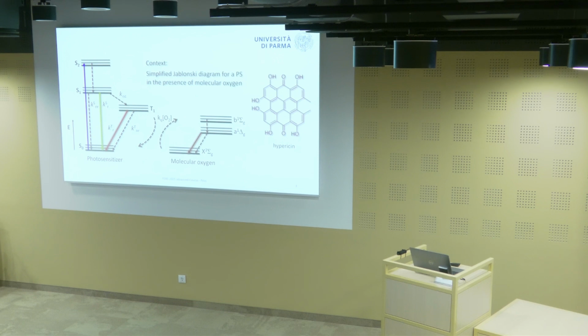And what we will do is touch methodologies that are able to have access to fluorescence emission, phosphorescence emission, triplet to triplet absorption, ground state bleaching, and if we manage, probably not because there is not enough time, we might touch also on photoacoustics, which is a method that is sensitive to the brown broken arrow, which are non-radiative relaxations. Again, here is hypericin.